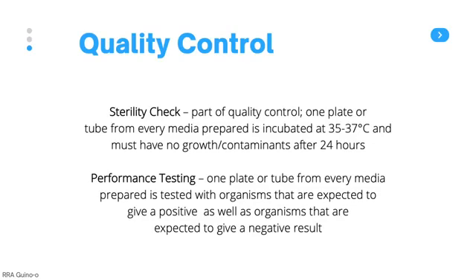The sterility check should be done every time you prepare a fresh batch of culture media. Meanwhile, performance testing should be done every time you open a new bottle or new lot of culture media.